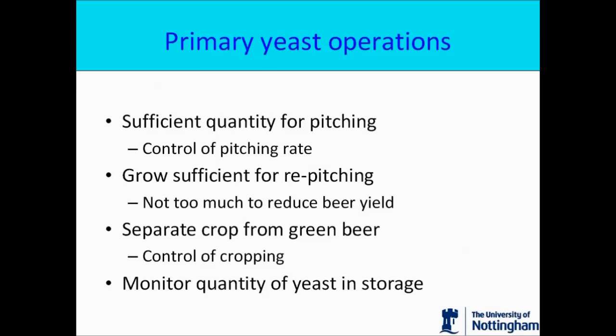At some point during the process you need to separate the yeast crop, so that you need to be able to control that in some way. That yeast is going to be cropped and put into a storage vessel, so that you probably want to know what's happening to the yeast whilst it's held in the interval between cropping and re-pitching.